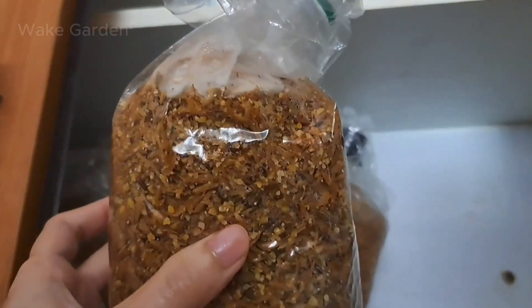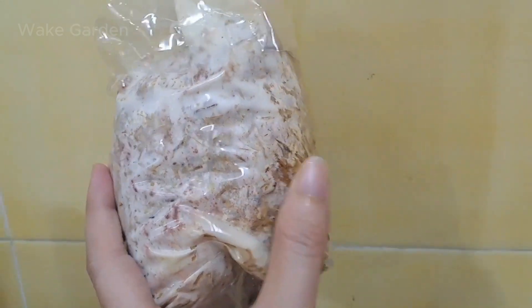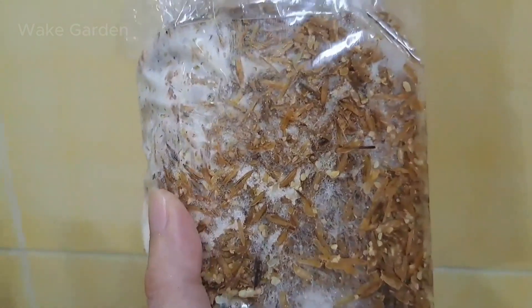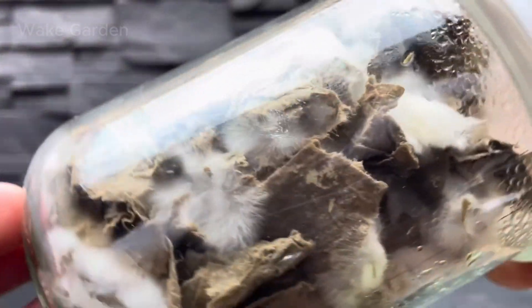Place your jar or bag in a warm, dark place — 65 to 75 degrees Fahrenheit (18 to 24 degrees Celsius) — and wait for one to two weeks. When you see white, fluffy mycelium spreading throughout, it's ready for the next step: expanding into a larger grow environment.